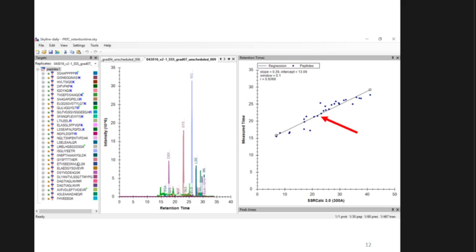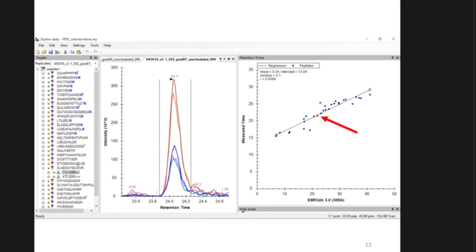a unique peptide. There's a special peptide down here in pink that you might not be able to see too well, but it has 3 letters and then ... 3 more letters. So that makes it easier to identify, because maybe I have another peptide in here that also starts with ELA. So what I can do, and Sue was talking about this too, if you click on one of these dots in the regression pane, the retention time regression view pane, it will take you to that peptide and show you that peptide's chromatogram.